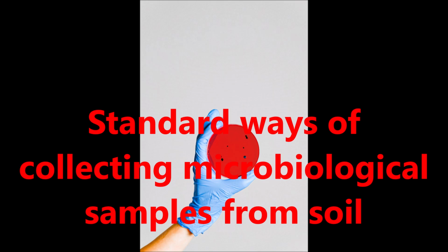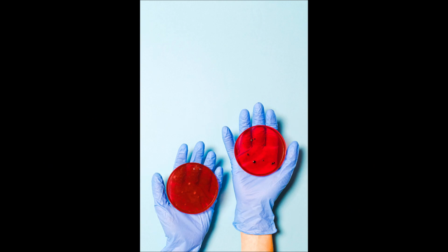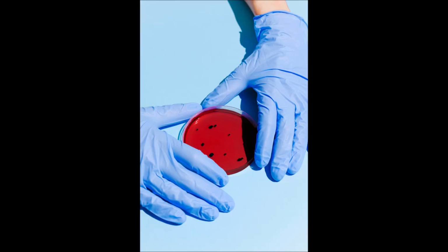When you are preparing to collect a soil sample, you have to consider the collection methods, which is the third step. So for the collection method, you have to consider the sample depth, the sample size of the soil, and the sample frequency.